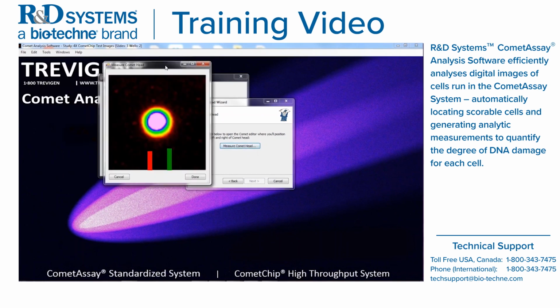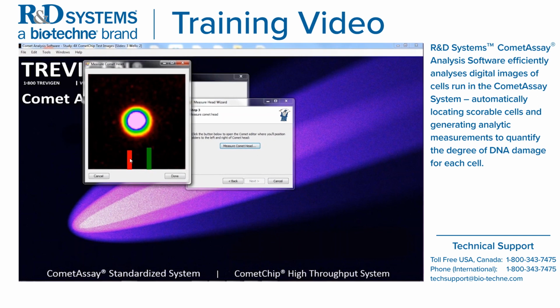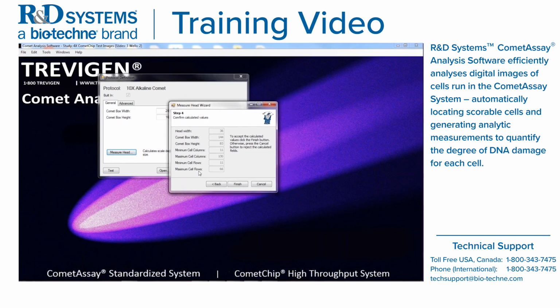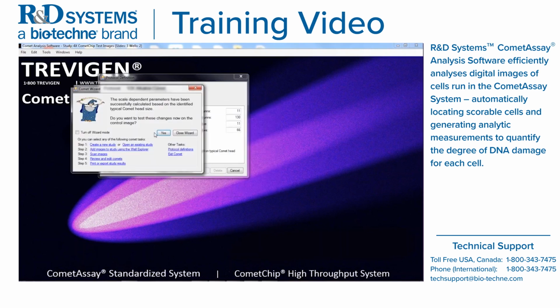And now you have another window coming up which allows you to have cursors. So move your cursor to the edge of the comet head and to the end of the comet head. Now select Done. All right. So the software is going to automatically perform some calculations. Just select Finish. Now the wizard comes up. Do you want to test these changes now on the control image? So say yes.